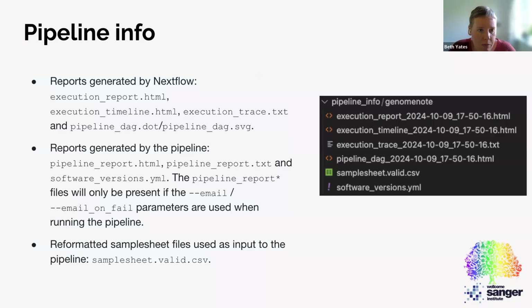In production, we keep a record of pipelines that we've run so that we can make sure that we're requesting the correct resources for running the pipeline, so that we can be more economical with energy usage, and make sure that we're not asking for too many resources on the cluster. It's just trying to make it as streamlined and as efficient as possible.